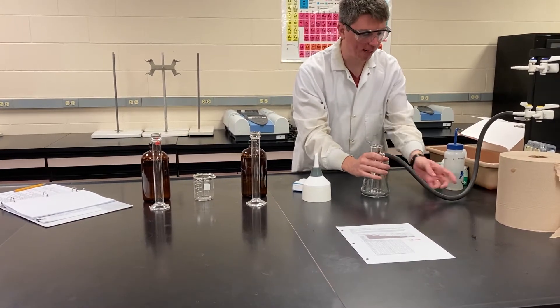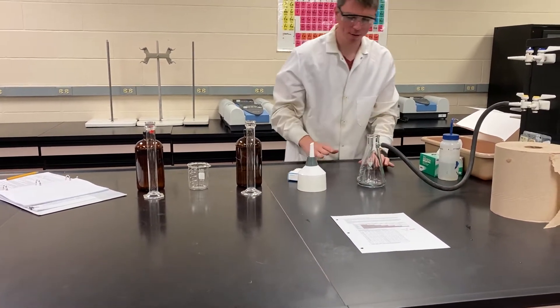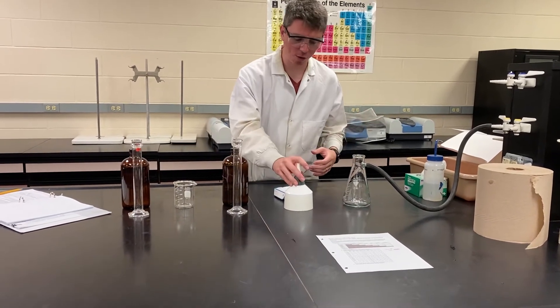One thing you want to be very careful of is make sure there's not tension in this hose, because it can knock the apparatus over. If you can't get the tension out of it, just have somebody hold it while you're working with it.